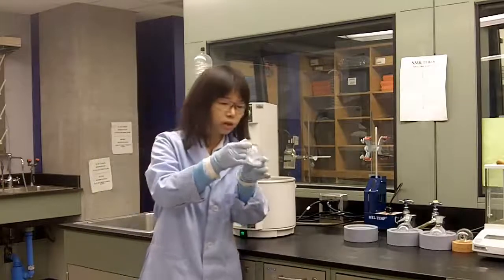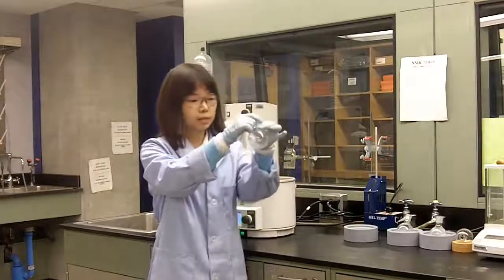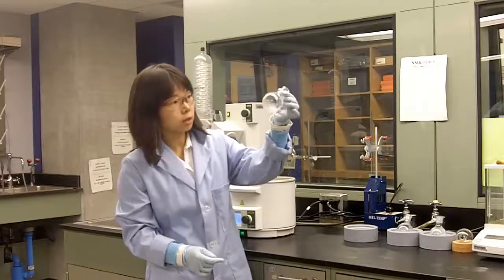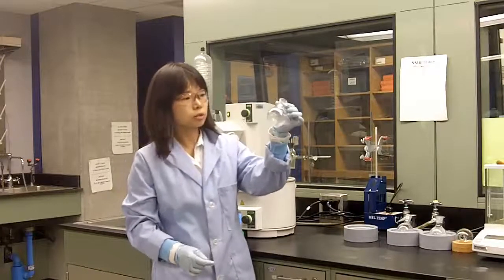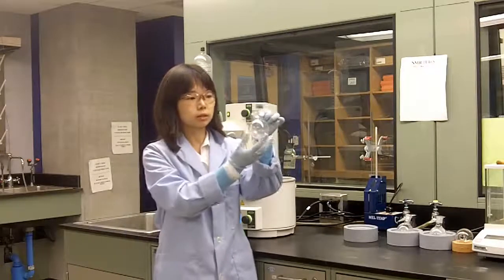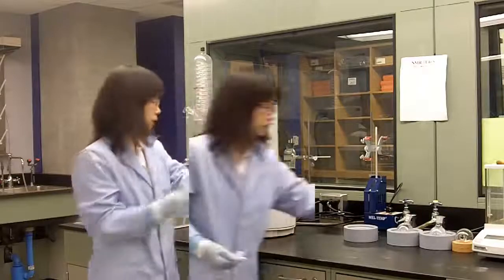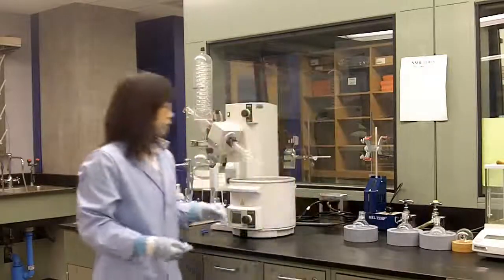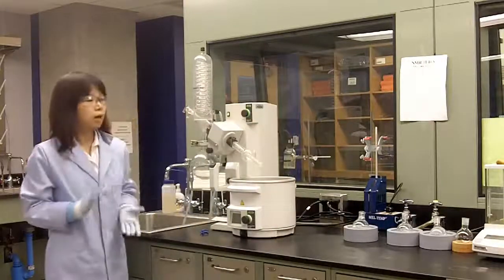You can see after the solvent evaporates, your compound is coming out as white solid. It's not a lot of solid, so you probably cannot see it very clearly. It's a white crystalline solid. That's the steps to use the rotary evap.